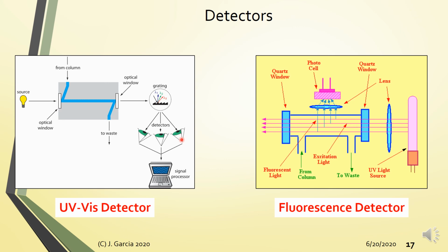Okay, so with the use of photodiode arrays, aside from the peaks, each peak will also have its corresponding UV-Vis spectrum. So you will get more information from that. However, it has lower sensitivity compared to when you use a photomultiplier tube. Okay? What you just can't do with UV-Vis detectors is wavelength scanning. Alright? So, in lieu of wavelength scanning, if you want to record the spectra, you need to use a photodiode array, as I mentioned.